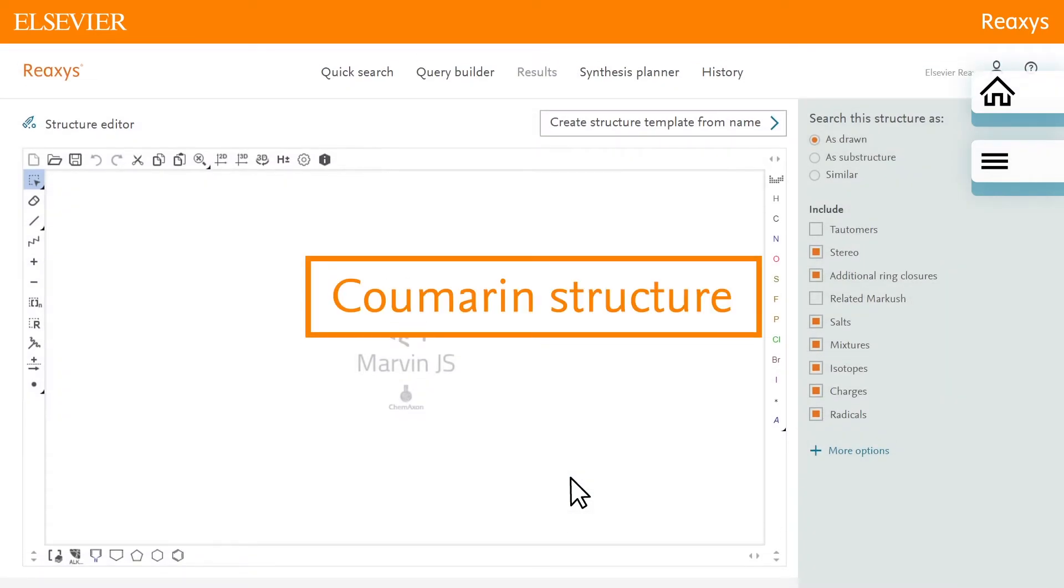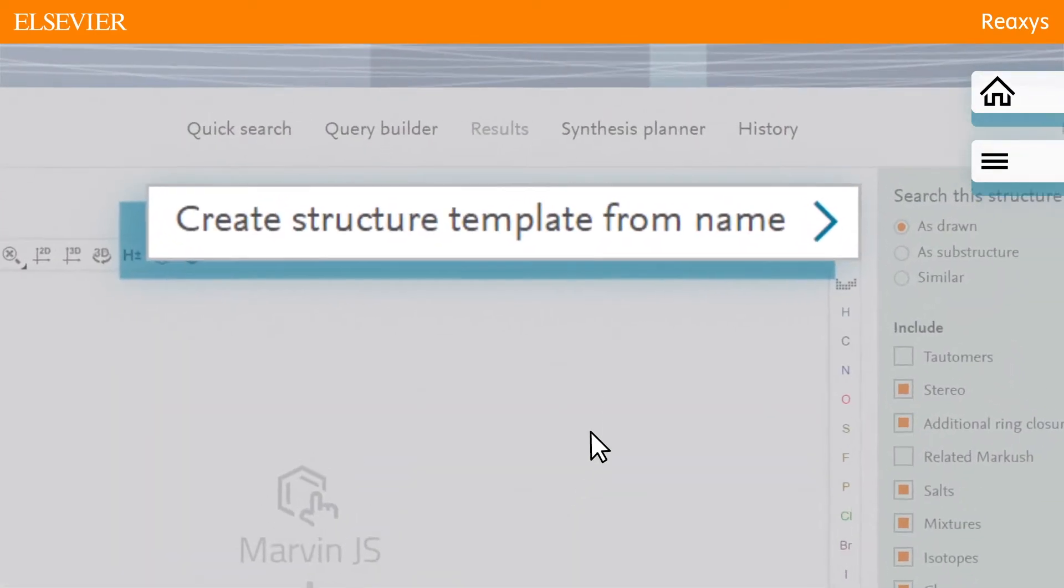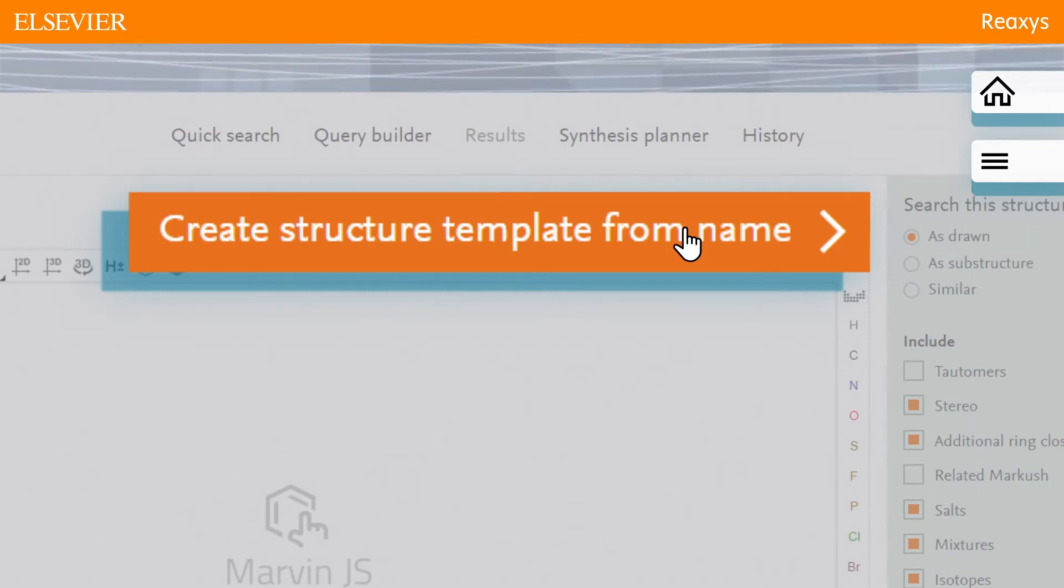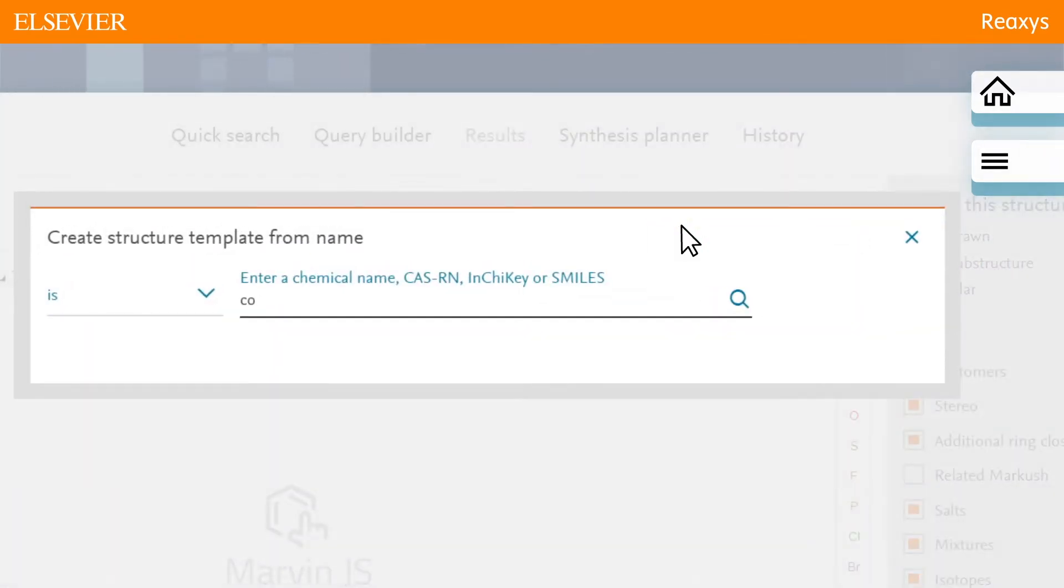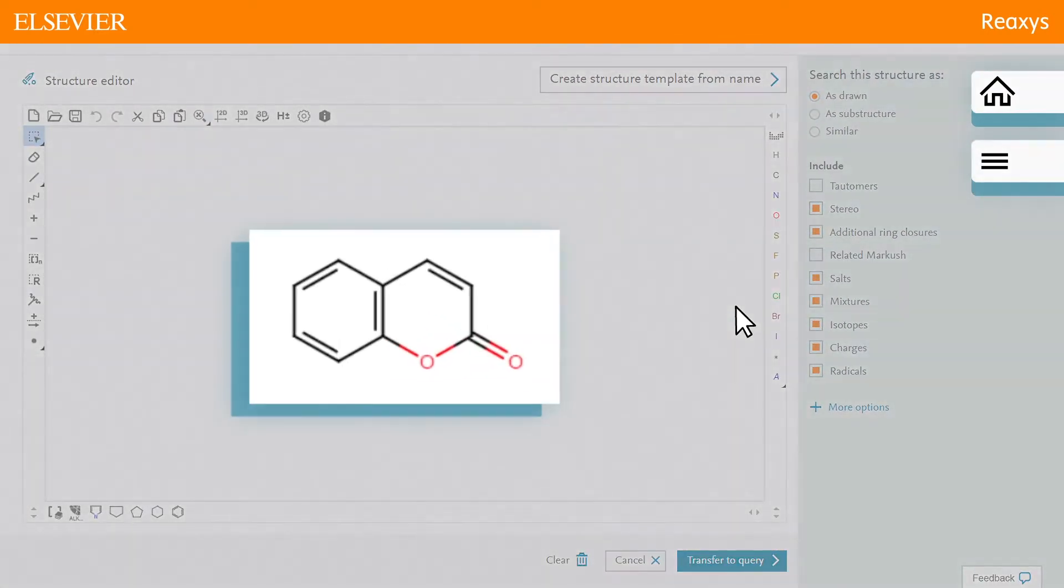Let's start with a Coumarin structure as a template. To do that, click Create Structure Template from Name and type Coumarin. A basic skeleton for the structure is displayed.